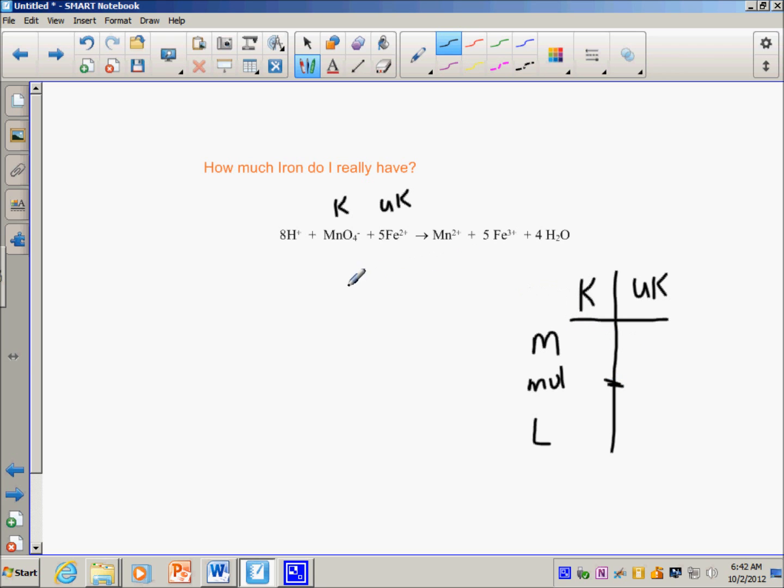We're going to add, given the concentration of the permanganate, we would be able to, at a 1:5 ratio, be able to determine the iron. All right, so in that case, this is this guy here, given this concentration here, given the amount of volume here. Now remember, this whole thing here is in the burette. Okay, this would be the concentration of stuff in the burette.